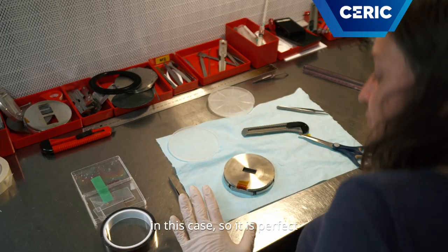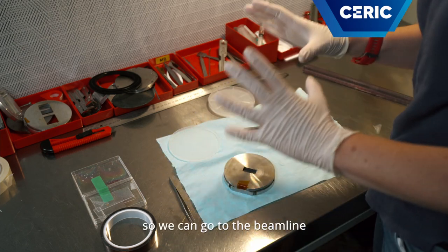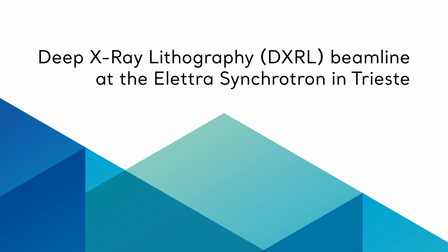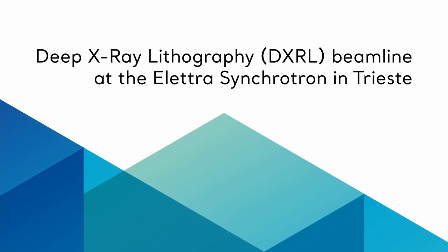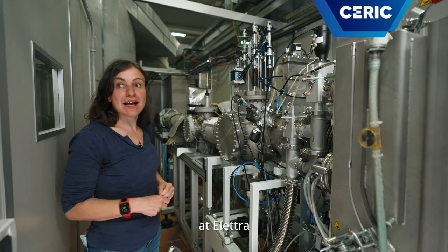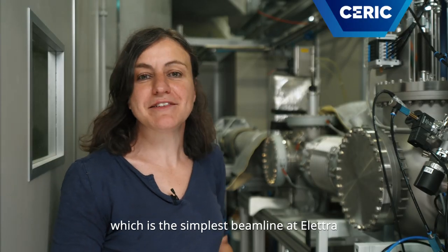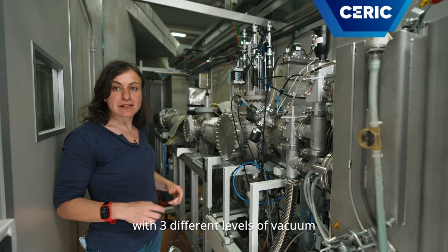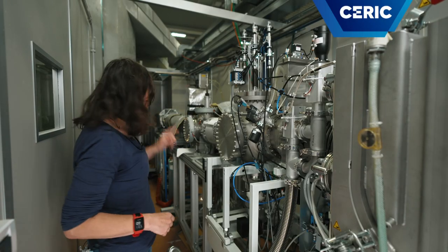What I do is just put the mask on the sample and see if there is a gap. And there is a gap in this case, so it's perfect. So we can go to the beamline and mount the sample. This is the DXR X-ray lithography beamline at Elettra, which is the simplest beamline at Elettra — it's just a vacuum tube with three different levels of vacuum.